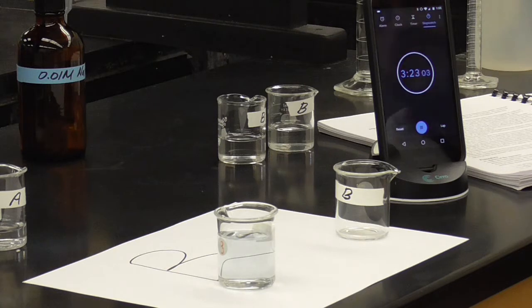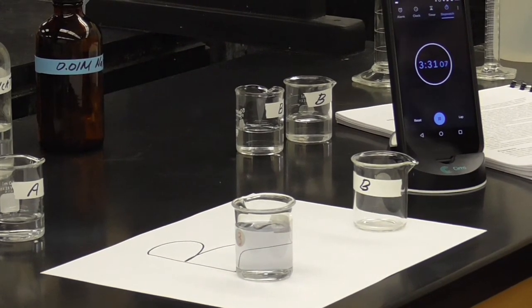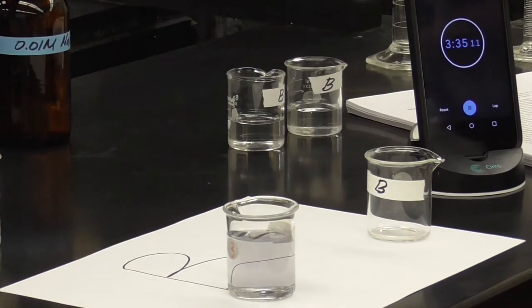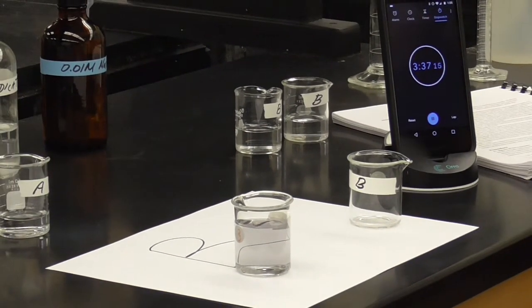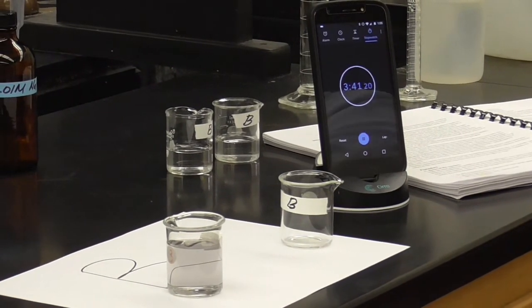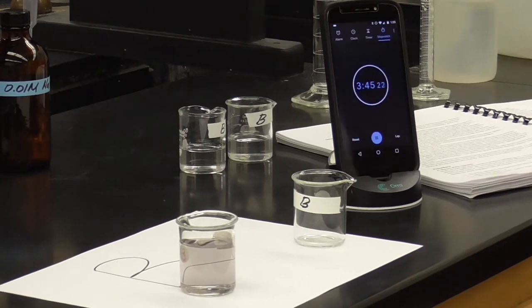Supposed to be seen. I don't know. There we go. Now we're getting some color. So hopefully you are looking at the timer, and you can back it up if you need to, but it changed color. It took about 3.5 minutes or so. You can get the exact time again for watching closely.